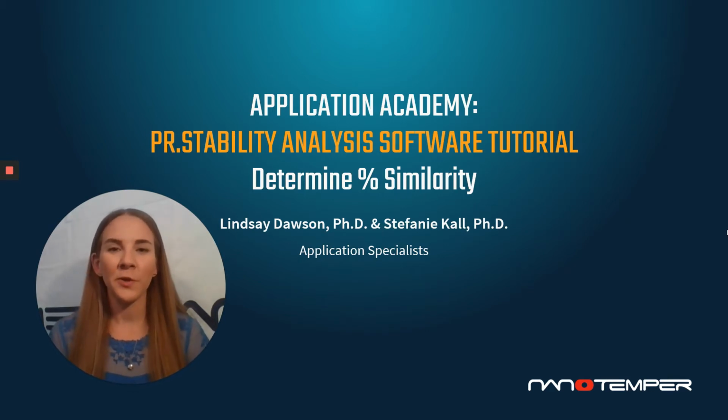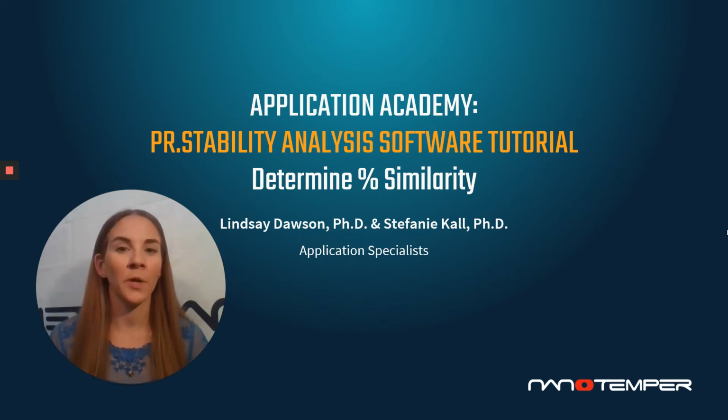In this tutorial, we're going to be discussing our similarity parameter that is now provided to you in the Prometheus Stability Analysis software. To provide a bit of a backstory on the origins of this parameter, we at Nanotemper truly value the feedback that we gather from our customers. And in developing this software, we noticed that there was a pretty large need to provide a parameter that allowed for the direct comparison of samples to one another.